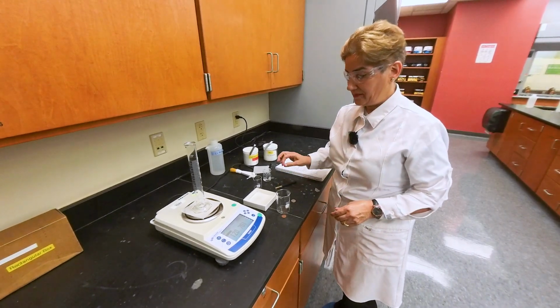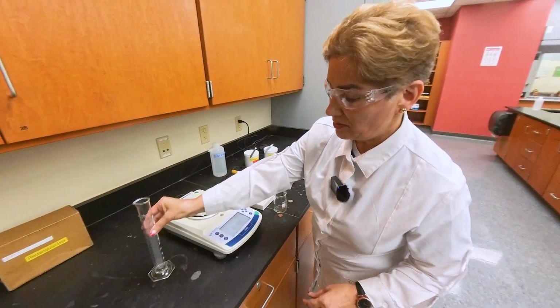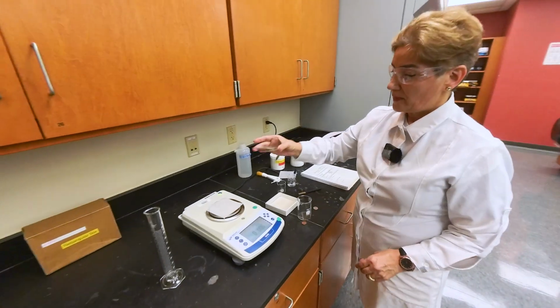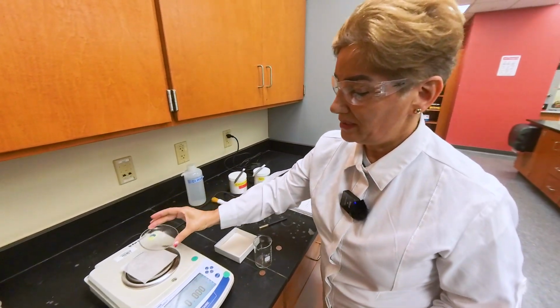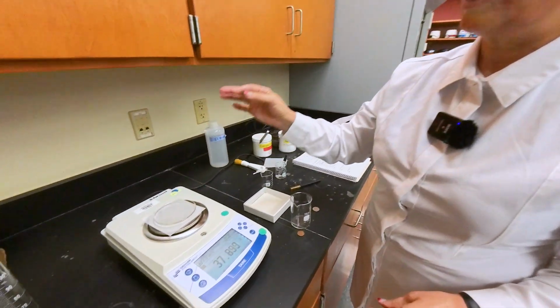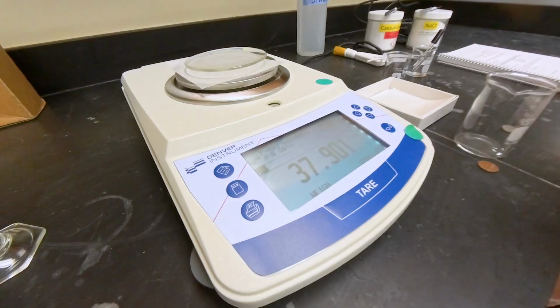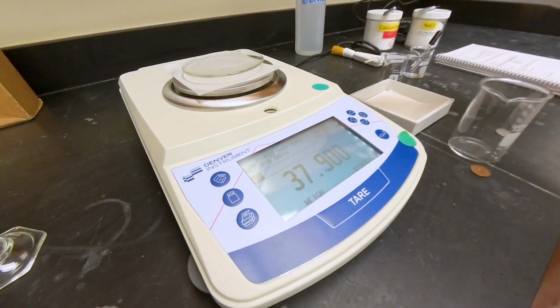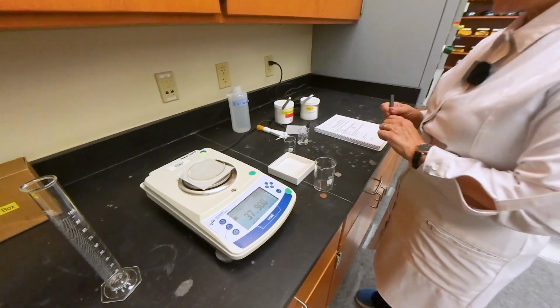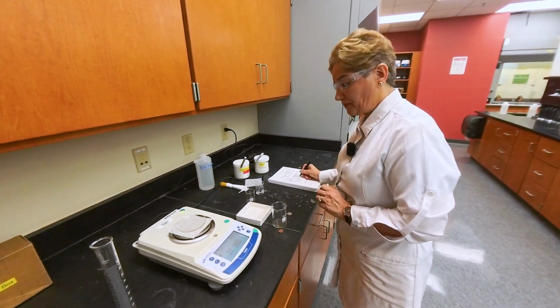And the worksheet that you have downloaded, and move to the next one. Next item would be our watch glass. The watch glasses, they come in different sizes. So the mass that we are recording is just for this particular one. Often students take another graduated cylinder or another watch glass, and they say the mass is different. Yes, the mass is different, even if the size looks the same.